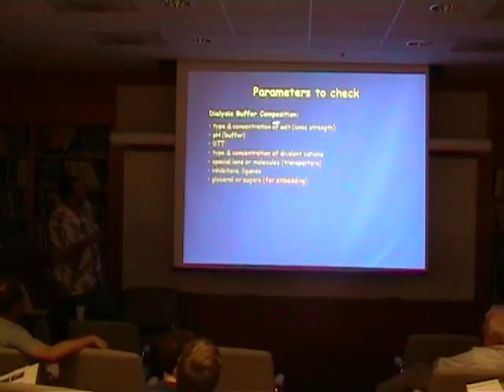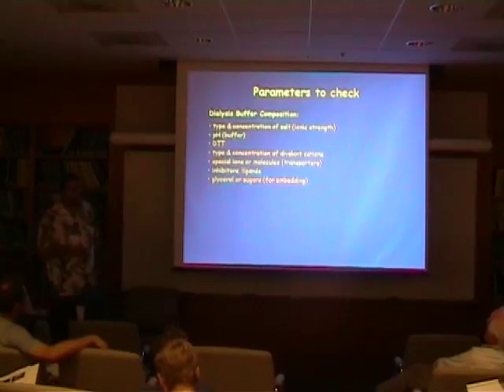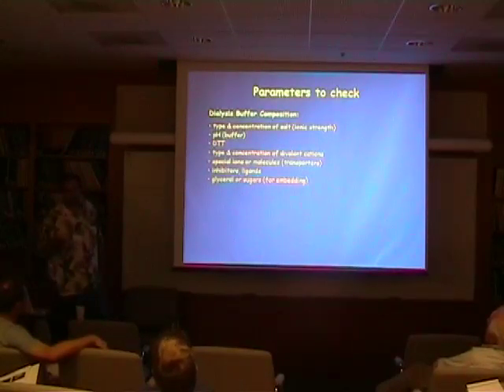And so obviously the type and concentration of the salt, which mostly affects the ionic strength, and the pH, depending on if you have a pH-regulated transporter, obviously pH is very important. Sometimes you have to reduce the protein, so that it stays nicely monomeric or whatever. Then divalent cations very often make a difference to the membranes that you get. And the effect that these divalent cations can have actually varies. Sometimes you can shift it from a vesicle to a sheet-like 2D crystal. Sometimes you can get better order. But almost always divalent cations have an effect, we find, in our hands.